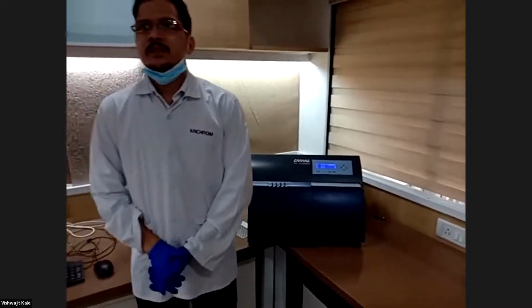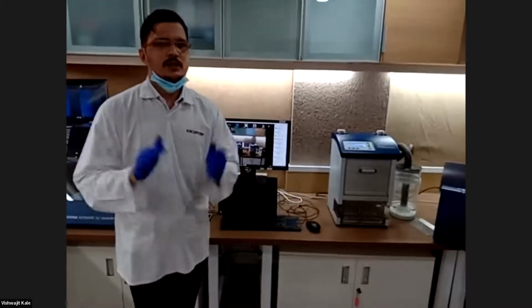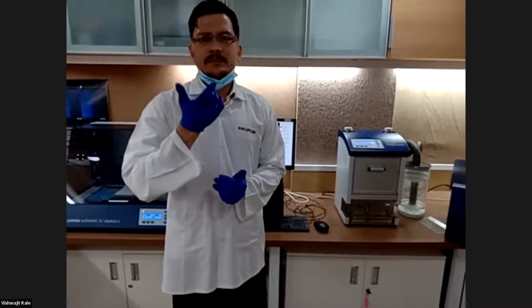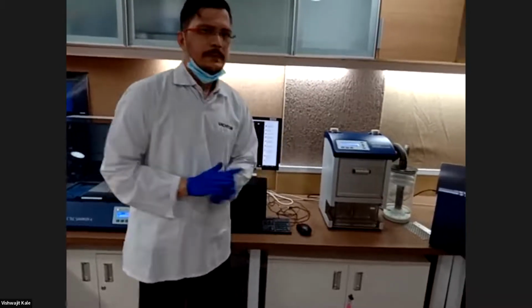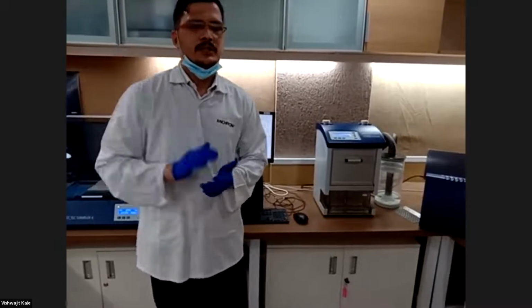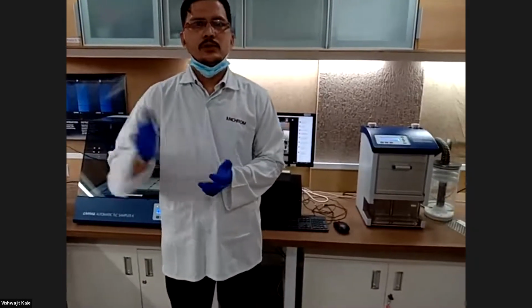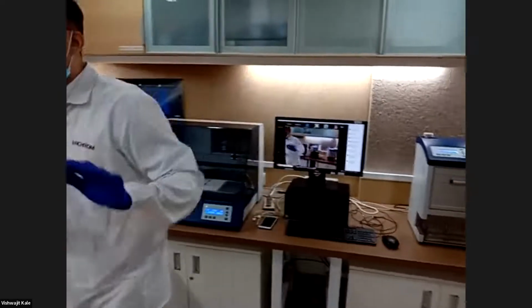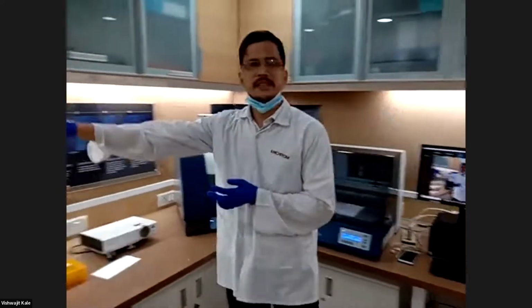Okay, sir. So now let us see the software part. For showing the software part, I will directly attach my cell phone to the server PC or any client PC. I will use Dr. Saikat sir's PC to share the screen with the VisionCATS software and show you the live sample analysis and the analysis file in VisionCATS software. But I missed one part in this complete demonstration, that is HPTLC Pro.